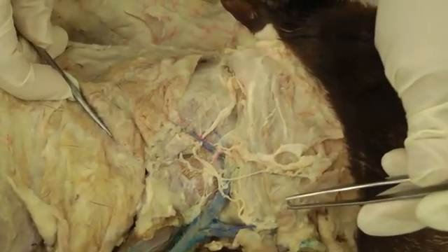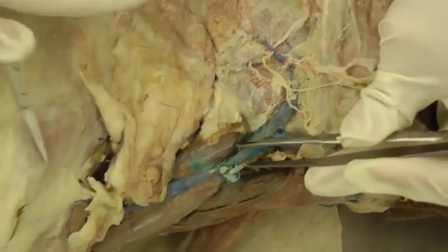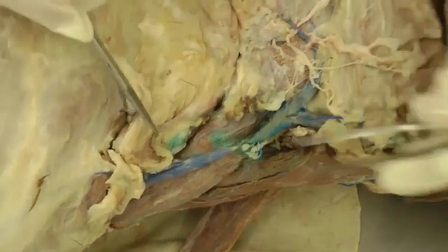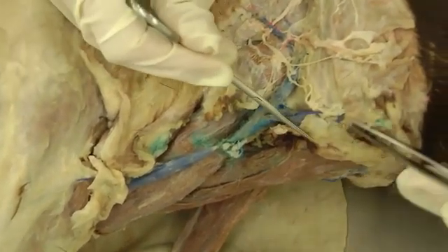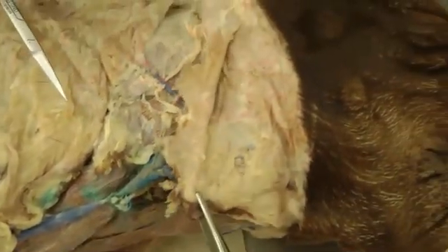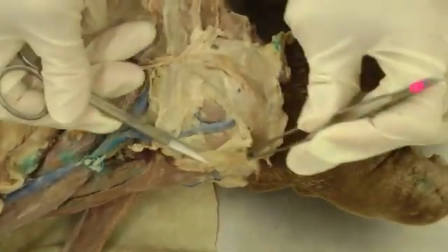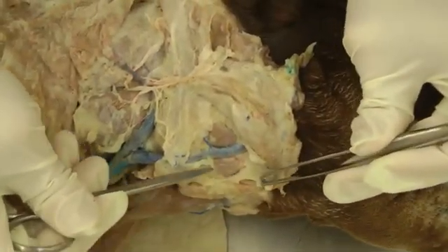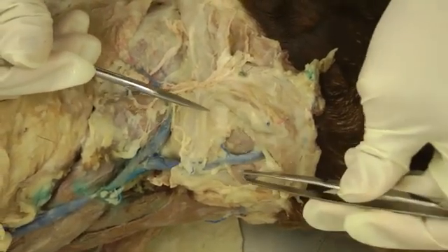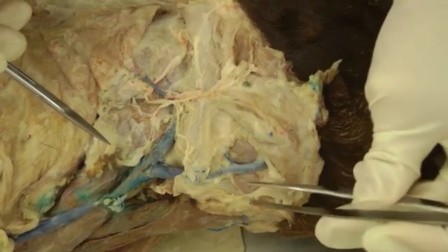The external jugular vein will be pretty obvious on your specimen and should be easy to find. Then you're looking for mandibular lymph nodes — take some of the platysma that we reflected on the other side and reflect that forward. You're looking for these mandibular lymph nodes on either side of the lingual facial vein.